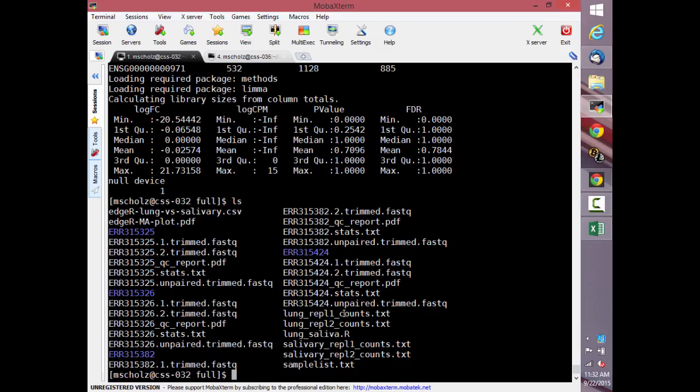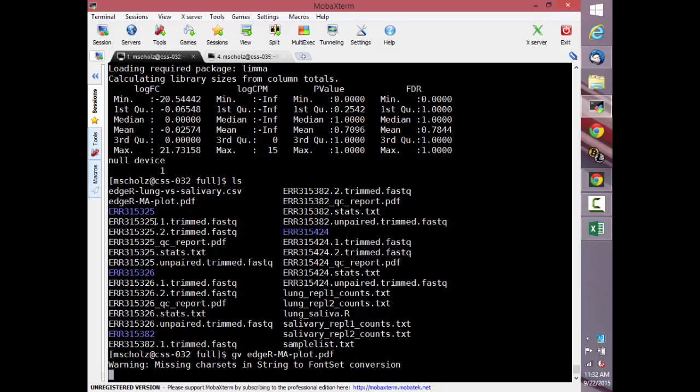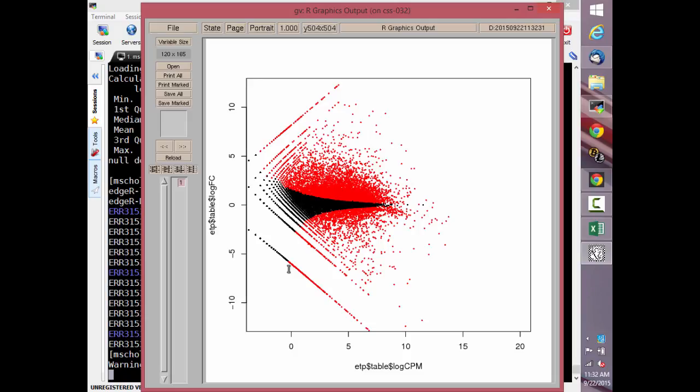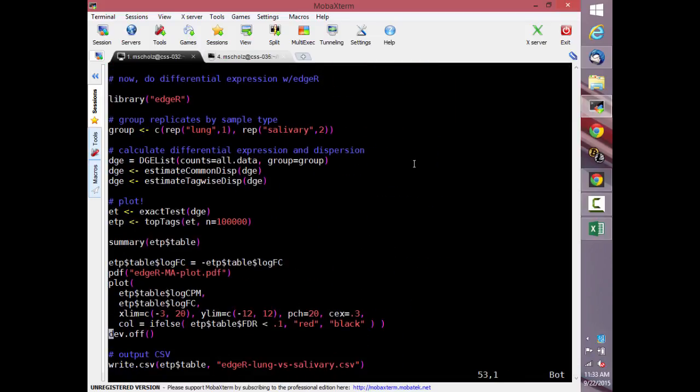It's a lot of stuff, right? Remember what I said yesterday, though. This is using an FDR of 0.1. So we got way too many. And again, this is just a graph, so you can go through and you can filter manually. But we can also change just the graphing requirement without doing anything else. Let's see what we get if we change this to 0.01, shall we?